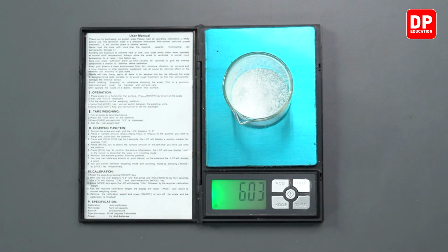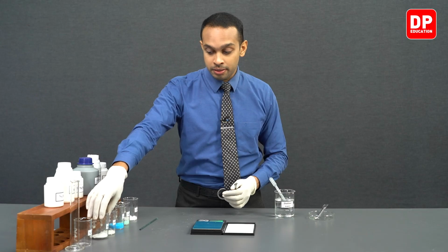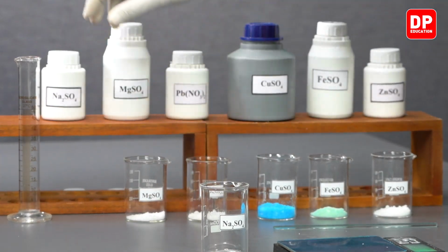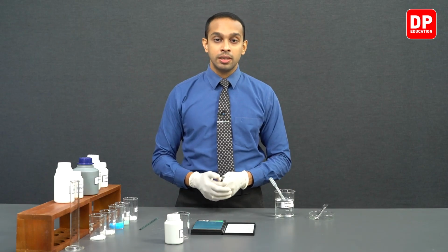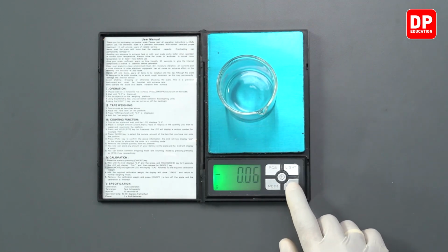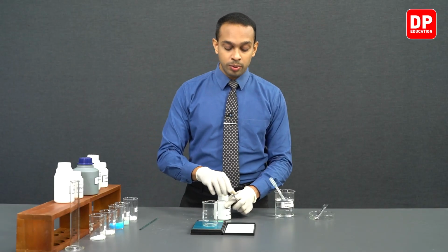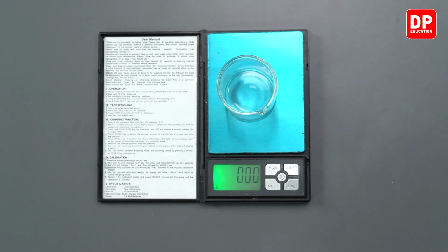Now students, we have measured the right mass of magnesium sulfate we needed to prepare 1 mole per decimeter cube concentrated magnesium sulfate solution. And then we finally move on to sodium sulfate. So we have a beaker labeled sodium sulfate, so we are going to measure the right mass of sodium sulfate into this beaker. We'll place the beaker on the balance, and then we will tare the balance. Afterwards, we can measure exactly 7.1 grams of sodium sulfate.